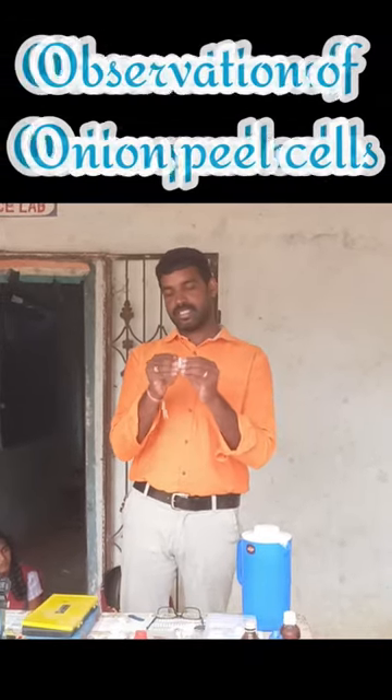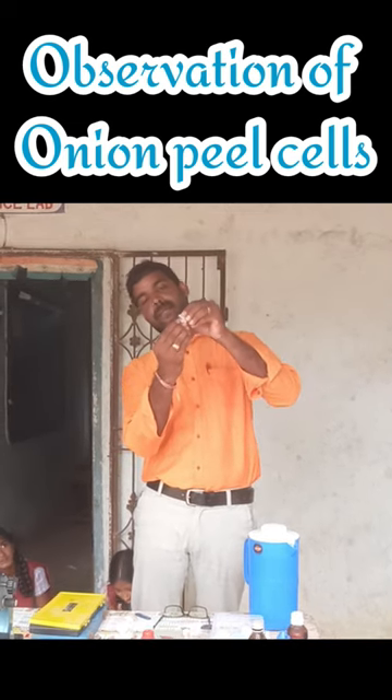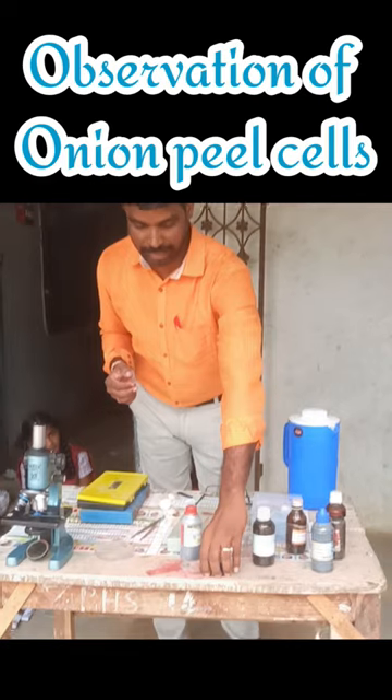Observation of onion peel: break the onion piece and take out the peel of the onion. Keep it in a petri dish.